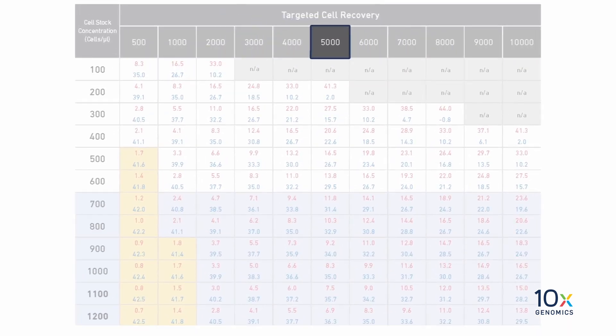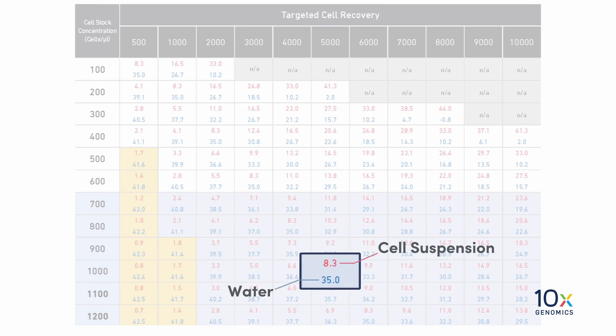In this experiment we are targeting 5000 cells and our cell suspension contains 1000 cells per microliter. As a result we need to load 35 microliters of water and 8.3 microliters of cell suspension into the master mix.